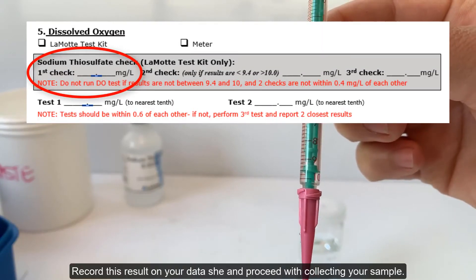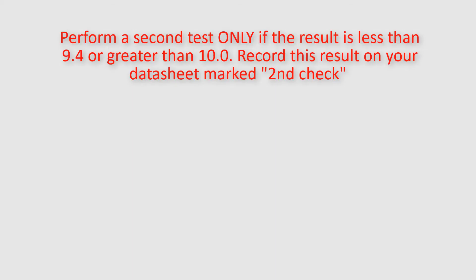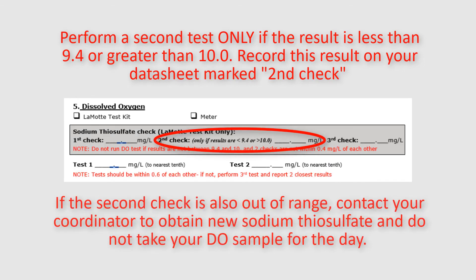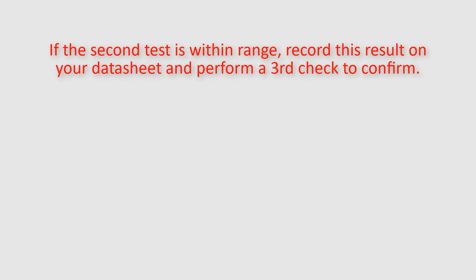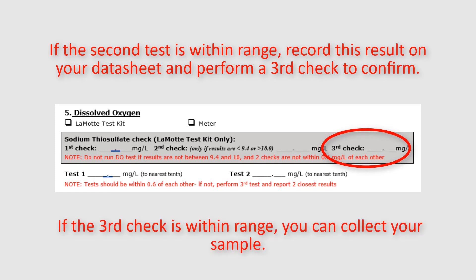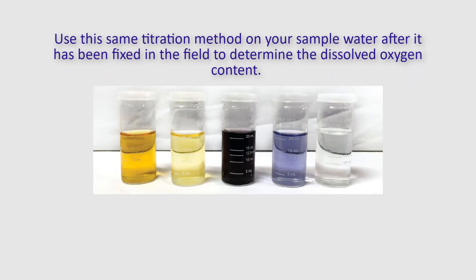Record this result on your datasheet and proceed with collecting your sample. Perform a second test only if the result is less than 9.4 or greater than 10. Record this result on your datasheet marked second check. If the second check is also out of range, contact your coordinator to obtain new sodium thiosulfate and do not take your DO sample for the day. If the second test is within range, record this result on your datasheet and perform a third check to confirm. If the third check is within range, you can collect your sample.